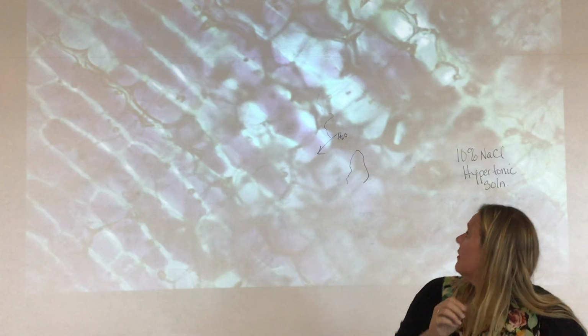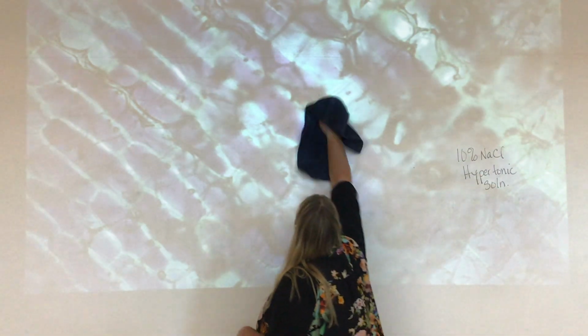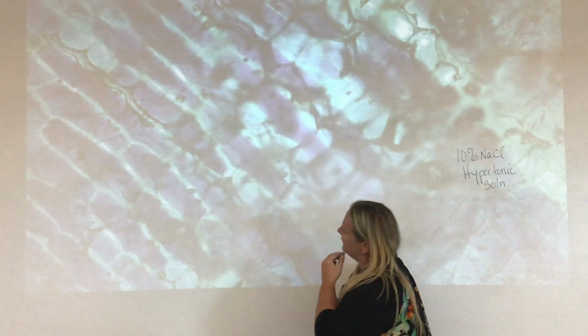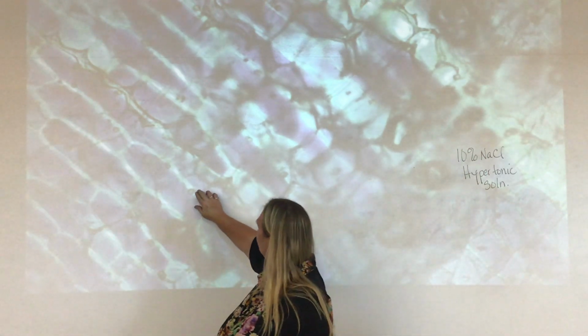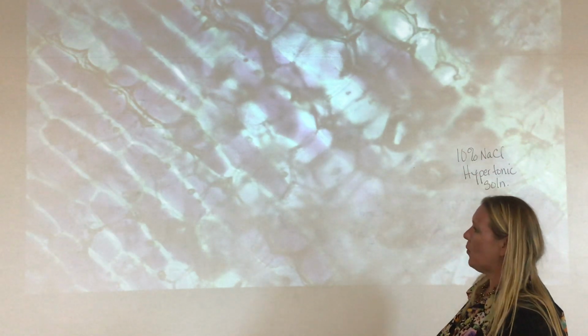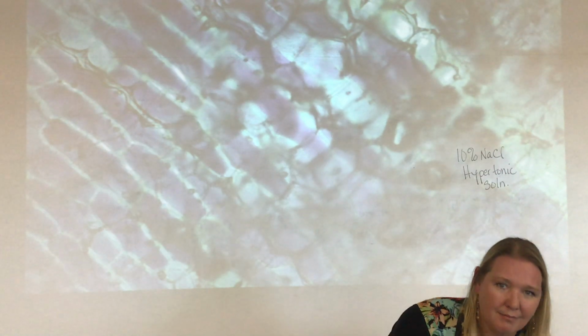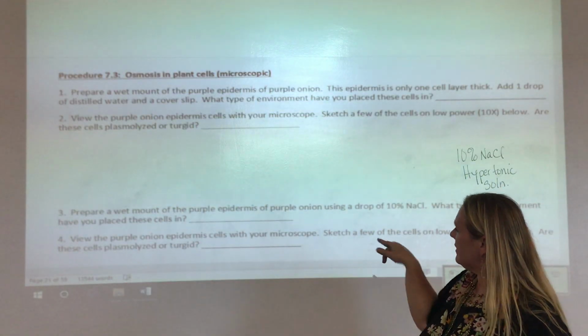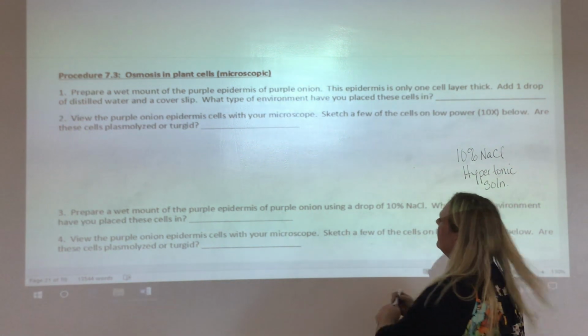The one right in the middle is a little misshapen. Okay, and we can see, again, the space is much larger. And it's just one that's going to have to take a few minutes to go. All right. So we'll come back to this, let this sit for a few minutes, and then let's answer these questions, and we can go back and see if we see some dramatic changes.